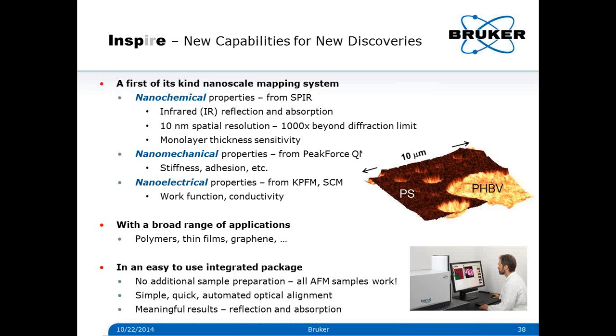But people have shown that you can map, for example, gold discs below a polymer in, I think, 50 nanometer depth, or you can look at doped silicon trenches in 100 nanometer depth. So it depends on your system, but in general, 50 nanometer should be no problem in depth resolution with SNOM. That you can probe 50 nanometer deep structures.